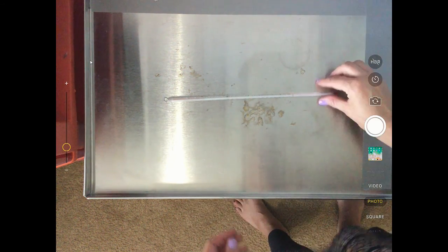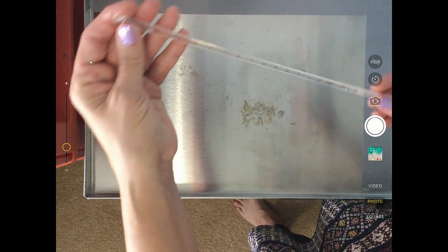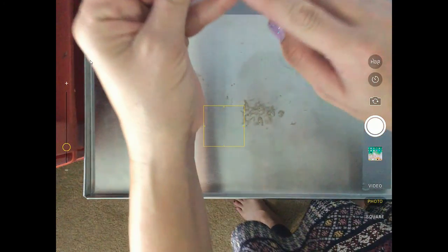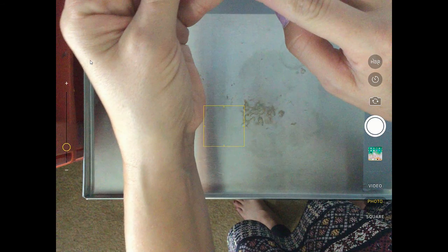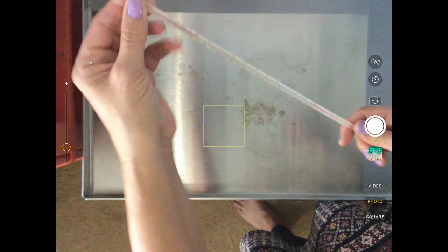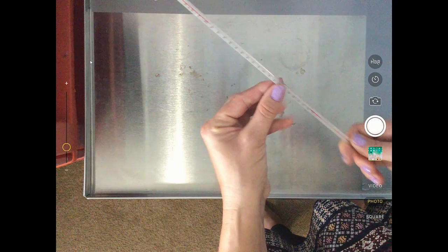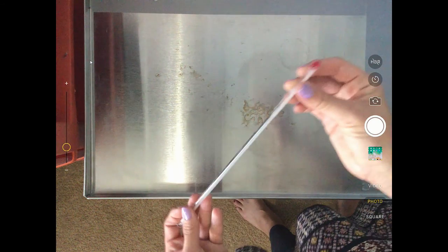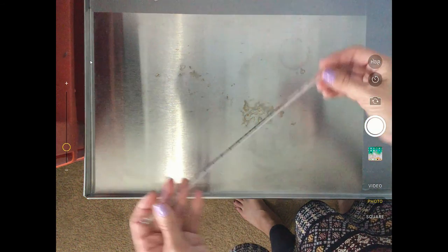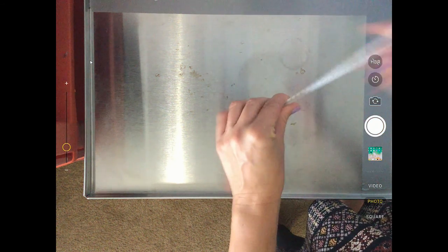One of the more common tools we're going to be using is a thermometer. This is probably one of the ones you're the most familiar with. The thermometer measures temperature. This thermometer will actually measure in Celsius and Fahrenheit. It's also got graduated hash marks all down both sides telling you where the temperature is at based on what you're measuring. You're going to want to always place the red end into the liquid that you're measuring the temperature of with a thermometer.